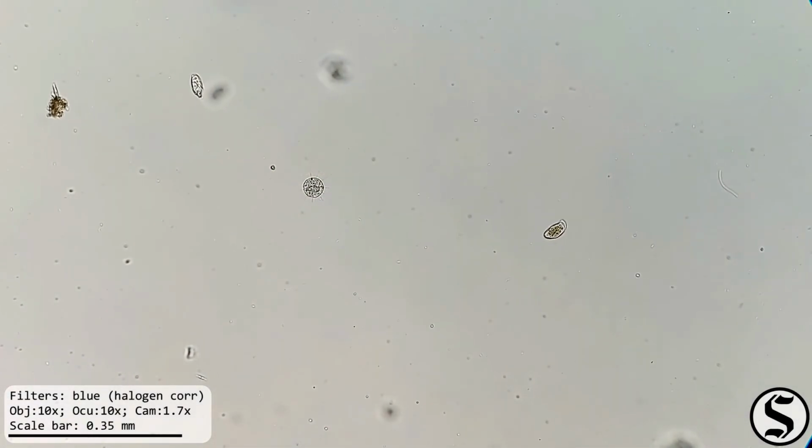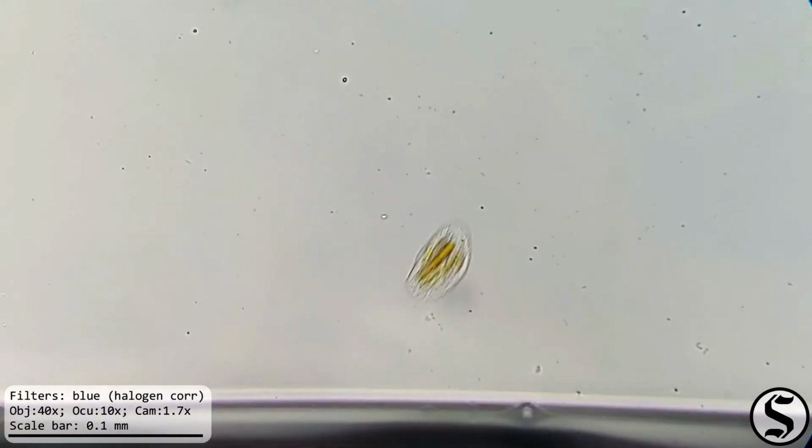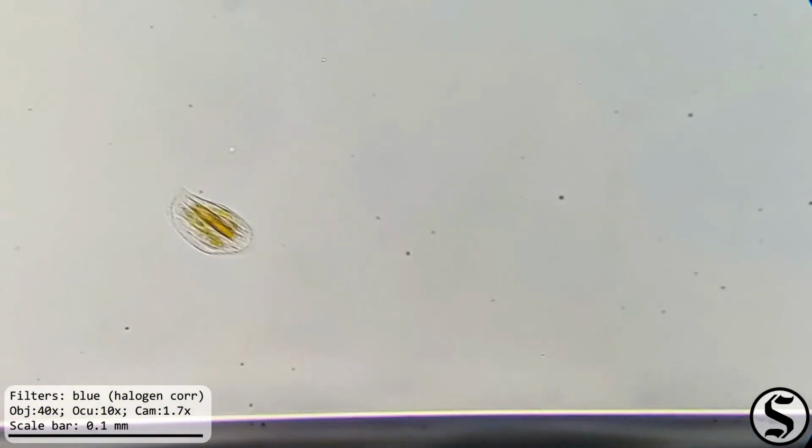And then nearby, we had this little ciliate. It's very active and very interested in the bottom of the slide. Had some difficulty following it and identifying it, but it looks like it's been eating some diatoms.